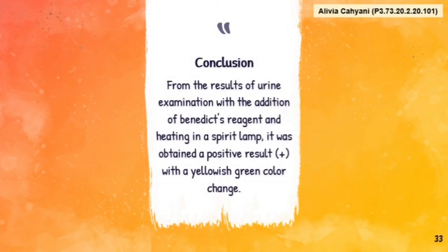Conclusion: from the result of urine examination with the addition of Benedict's reagent and heating in a spirit lamp, a positive result was obtained, with a yellowish green color change.